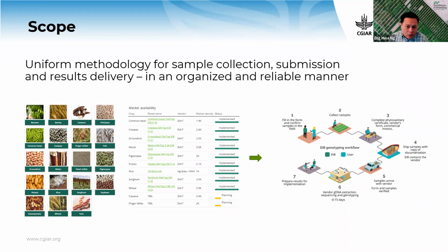So this is a much needed switch, as for the past few years we've been managing shared services, primarily the low and mid-density genotyping platforms. With everybody's support, the user base has grown quite tremendously over time.